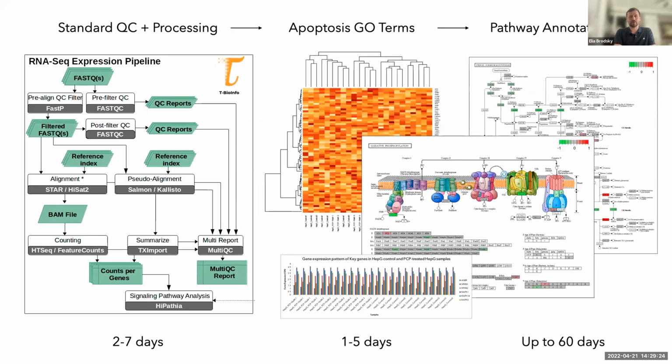One of the most common projects is RNA sequencing. Typically, one of the limitations of an RNA-seq project is that you get your standard outputs, the tables, but a lot of questions only start appearing after that initial processing is done. So our goal was to develop a standardized pipeline.